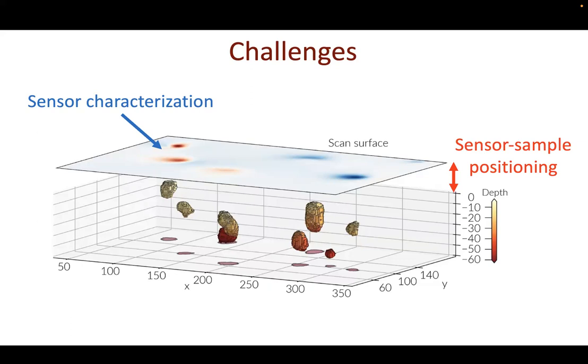And then lastly, a thing that is really important to consider is that the micro-CT has a lower limit to its resolution. Currently, we're using micro-CT scans with a resolution of 350 nanometers. But that means that all grains that are smaller than that, or smaller than half a micron, just don't show up. You don't resolve them in your micro-CT scan.